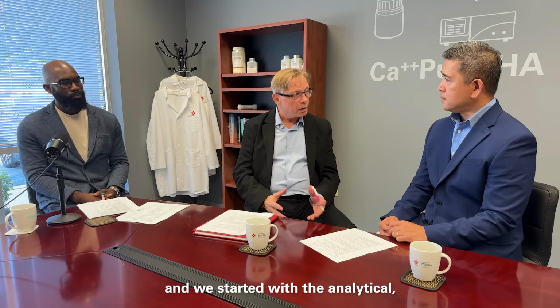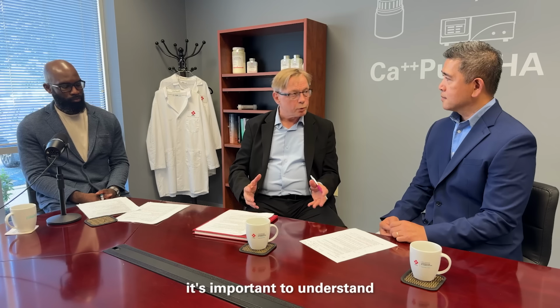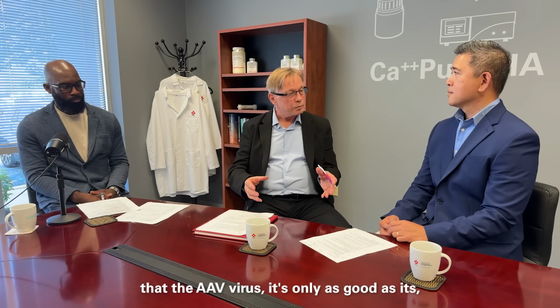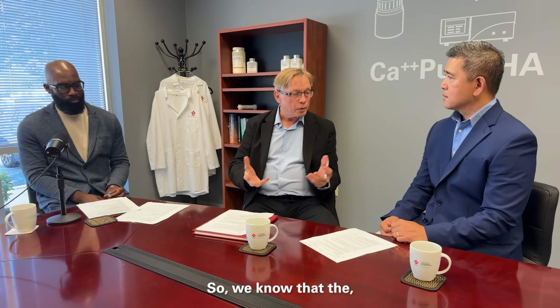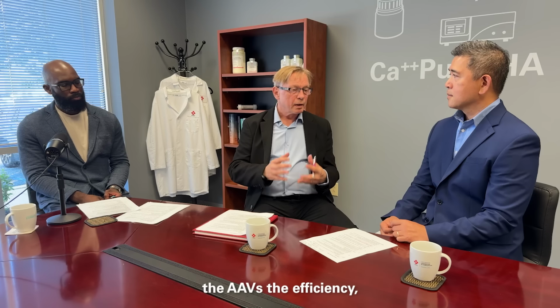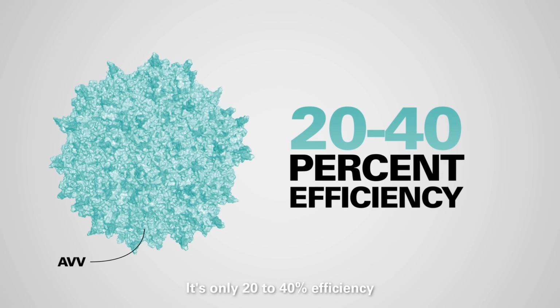So we took a project in the laboratory recently where we started studying the AAVs, and we started with the analytical part. First it's important to understand that the AAV virus is only as good as its therapeutic genetic material inside the virus. If there's no genetic material inside the capsid, there's actually no potency. And we know that with the method by which we purify and produce the AAVs, the efficiency of how you pack the DNA material is only 20 to 40%.